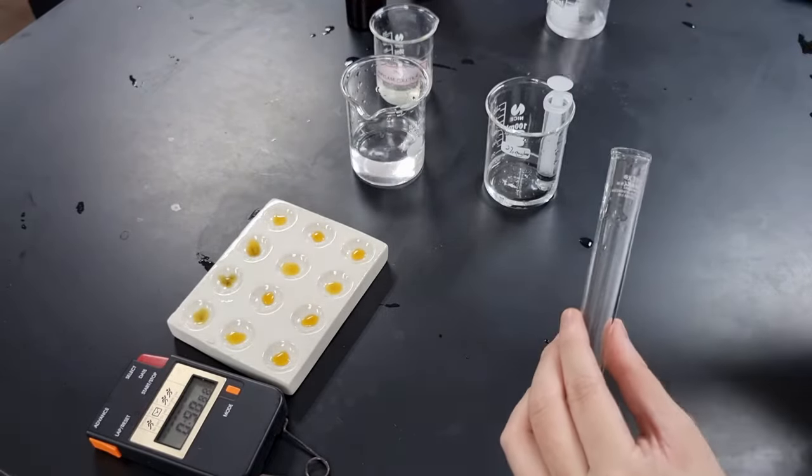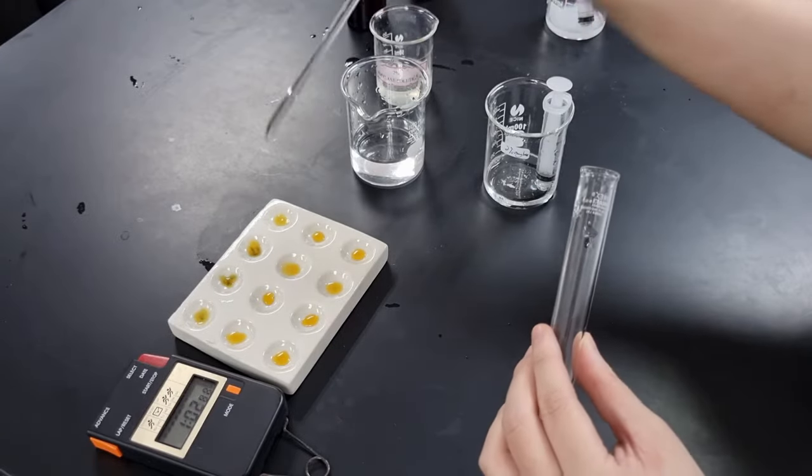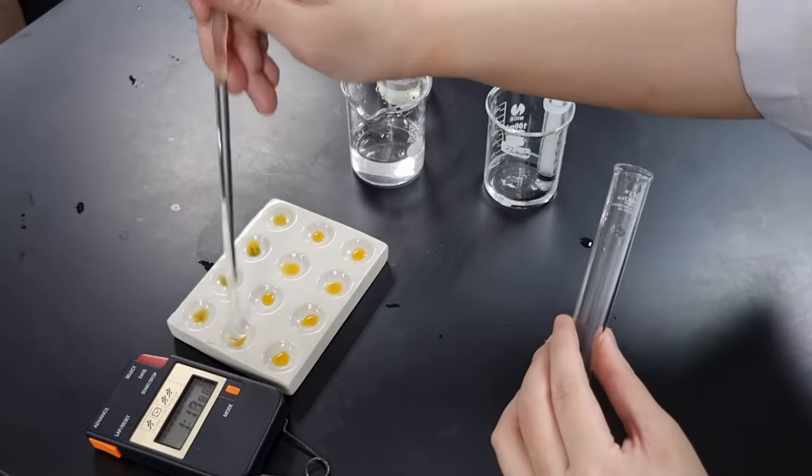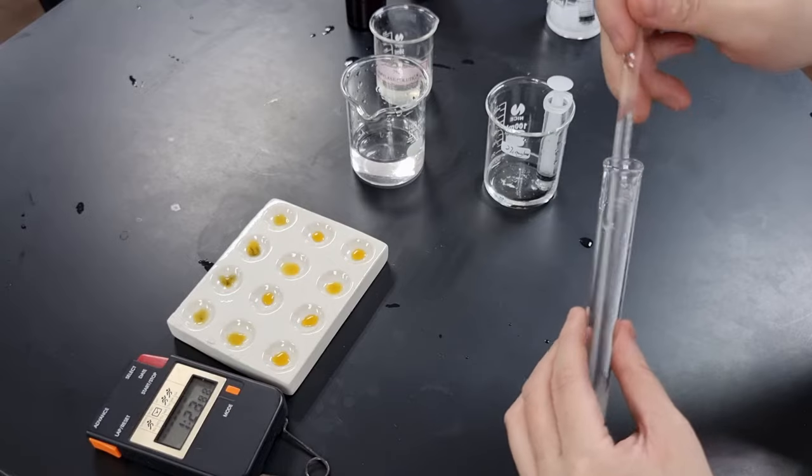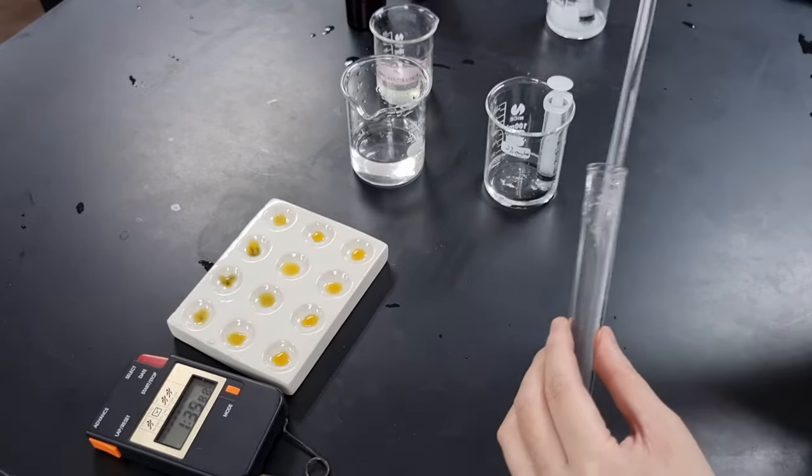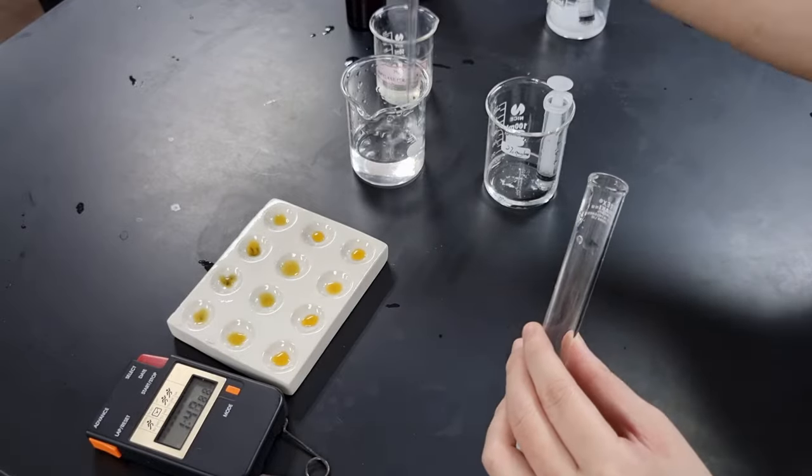This video is obviously sped up. It's always stir, drop it into one well, and then a little dip into the water just to rinse off the excess iodine. You repeat this until the solution in the well remains yellow.